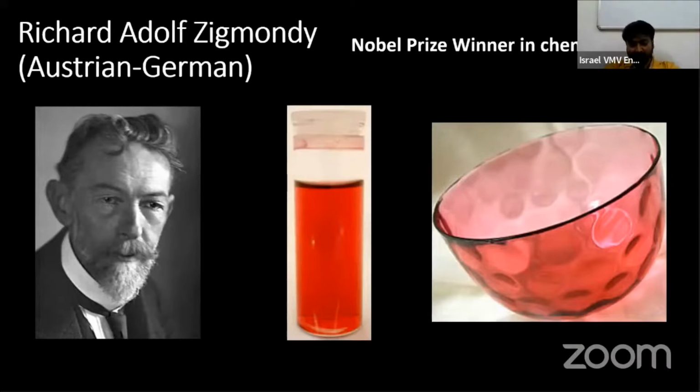What makes the difference? Just the change of size makes the change in the color. Color is not just mentioned in the aesthetic sense. Color means wavelength. Color means wavelength of absorption. Wavelength of absorption again translates to wavelength of emission. And these are linked to the applications. These are linked to the spectroscopy.